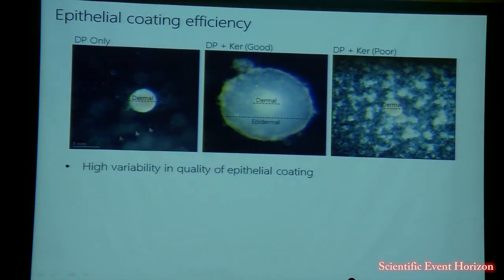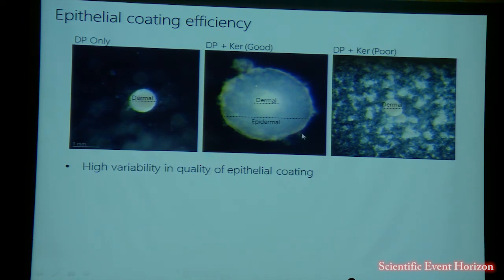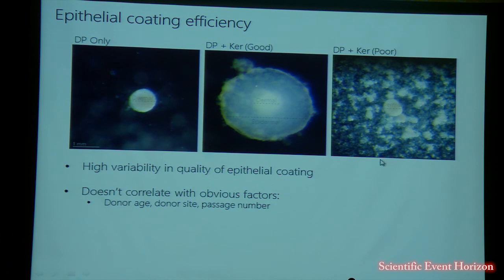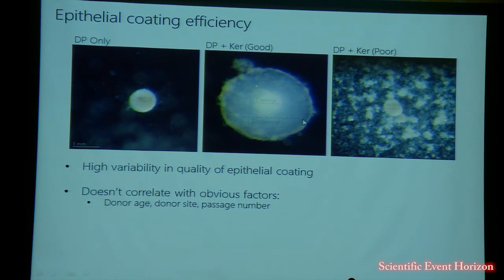This is an example of our attempts to make double spheres. This is a nice dermal papilla sphere with a tight core. After three days of formation, we add the epithelial cells into the hang drop. Unfortunately we're getting extremely low efficiency of coating — only about 20% of the time do we see a good double sphere with the tight dermal core and epithelial cells sitting tightly around it. Normally the epithelial cells stick to each other rather than onto the dermal core, with no clear correlation to donor age, donor site, or passage number. We're continuing to work on this and hoping to get sufficient numbers to analyse the gene signature of the dermal core.